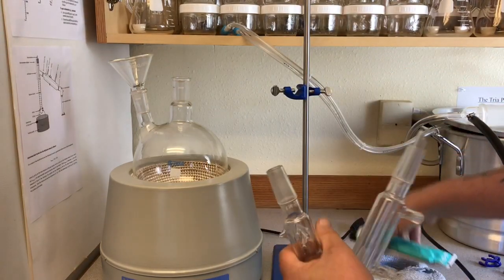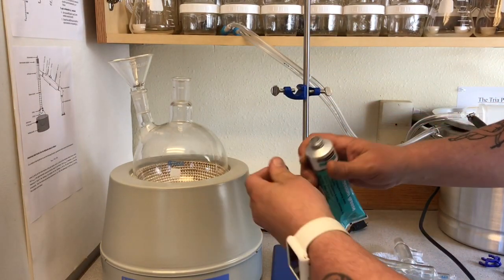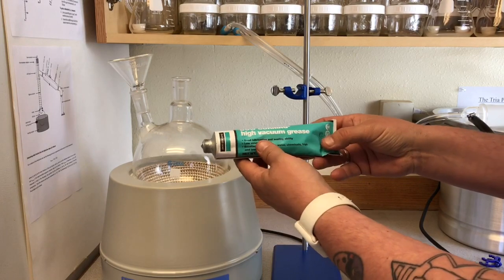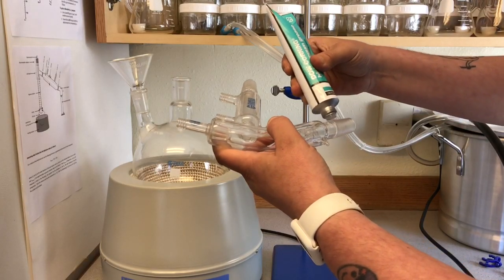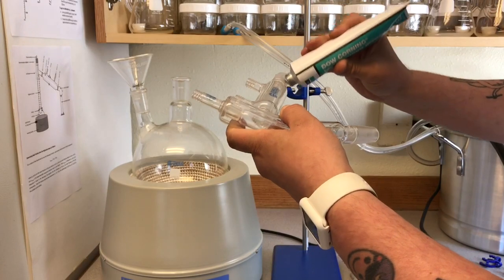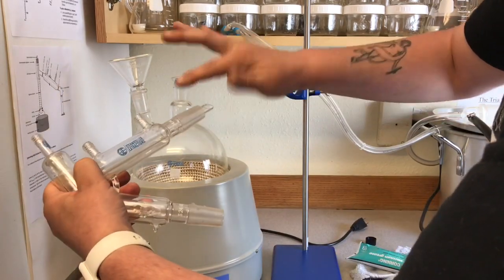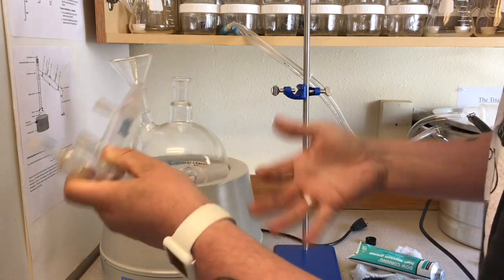So to put our distillation head on here, we're going to get some of this Dow Corning high vacuum grease, and we're going to put a little bit of this on each of our joints. This says good lubricating and sealing ability, low volatility, excellent resistance to water, chemicals, high and low temperatures. So this is one of the best products that you can use for this, and it's not cheap, but it's a very high quality product, and you really don't need a whole lot. So I just smear a little bit around like this. You just want to use the very top of the joint. You don't need to lubricate the whole joint, just the top area.